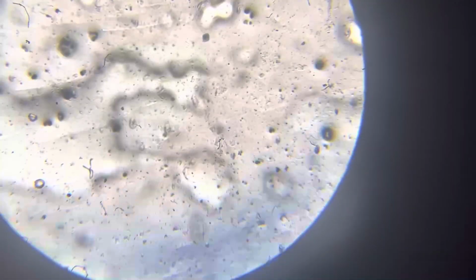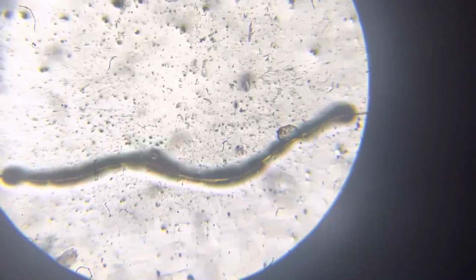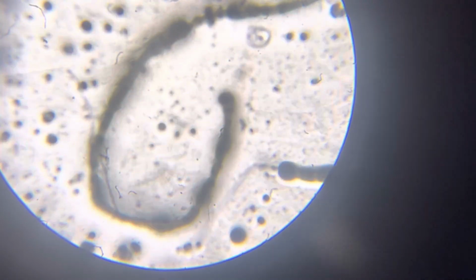I'm not sure. I really need the help of biologists, marine biologists or something like that, or not marine, just biologists without the marine. It's okay. This looks like small Neros, and another sausage. So definitely sausage. This is again at magnification of 64.